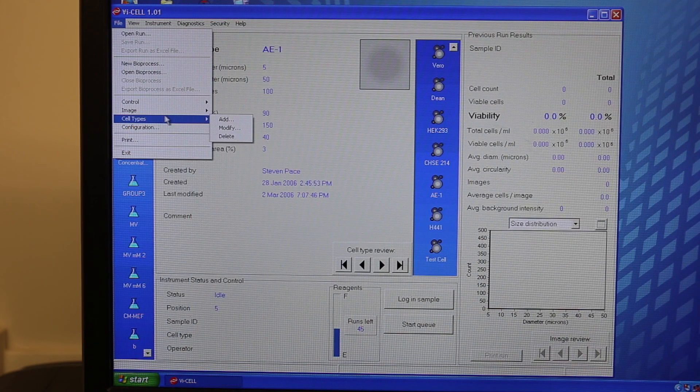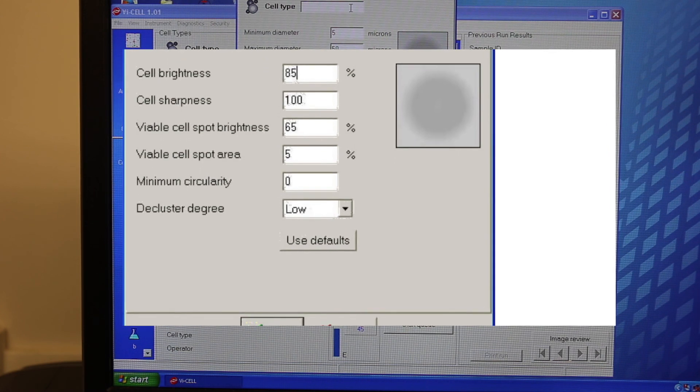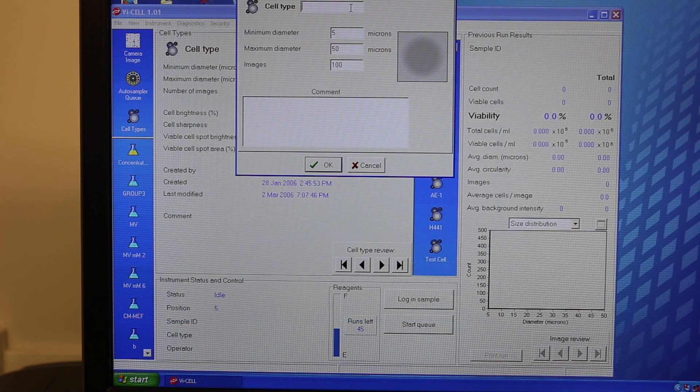In addition you can change the brightness, sharpness, viable spot brightness, and viable spot area that the computer will use to measure whether the cell is viable, non-viable, or whether it is indicated as a cell or not shown up on the image.